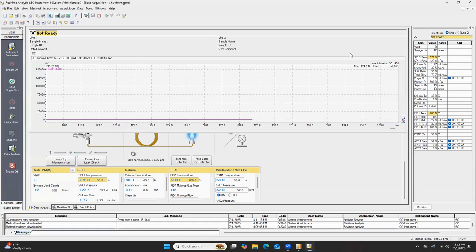Also, tell them if people get in early and want to go ahead and prepare our samples, like Dr. B was talking about, that way whenever we get here, the first thing we can do is start. Okay, I will be here at 8. So what do you want me to do? Follow Dr. V's protocol for preparing the sample.